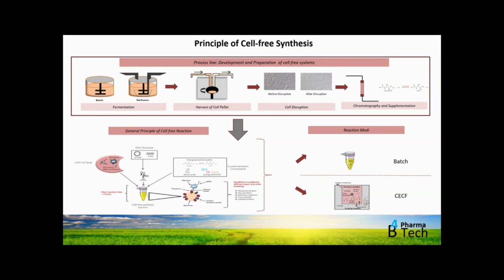And if you're working with membrane proteins or secreted proteins, membrane proteins are embedded in vesicles, and secreted proteins end up in the luminal part of these vesicles. There's a constant energy regeneration system.